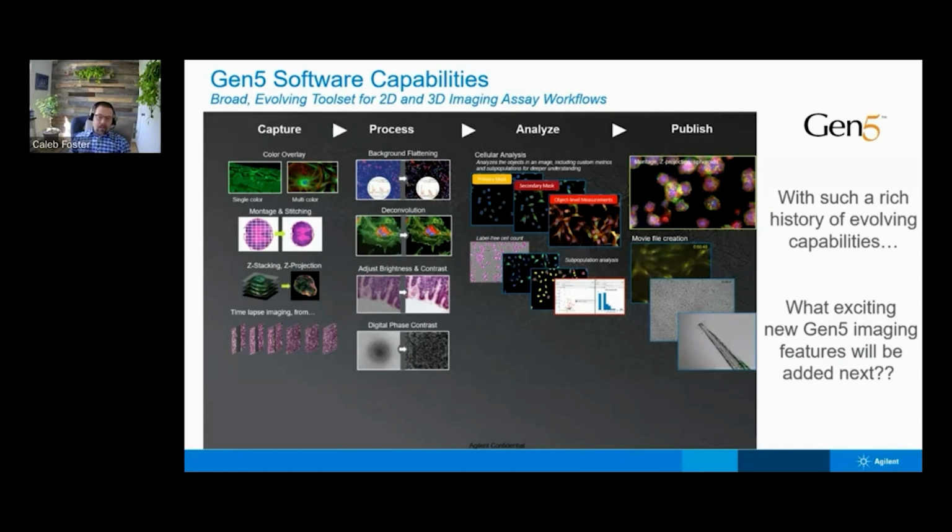Cloud-enabled software is really going to help make more connected workflows and connected laboratories. We have companies that are globalized, with labs across countries or across continents, and that connectivity is going to be really important to share and collaborate with teams in a real-time fashion.